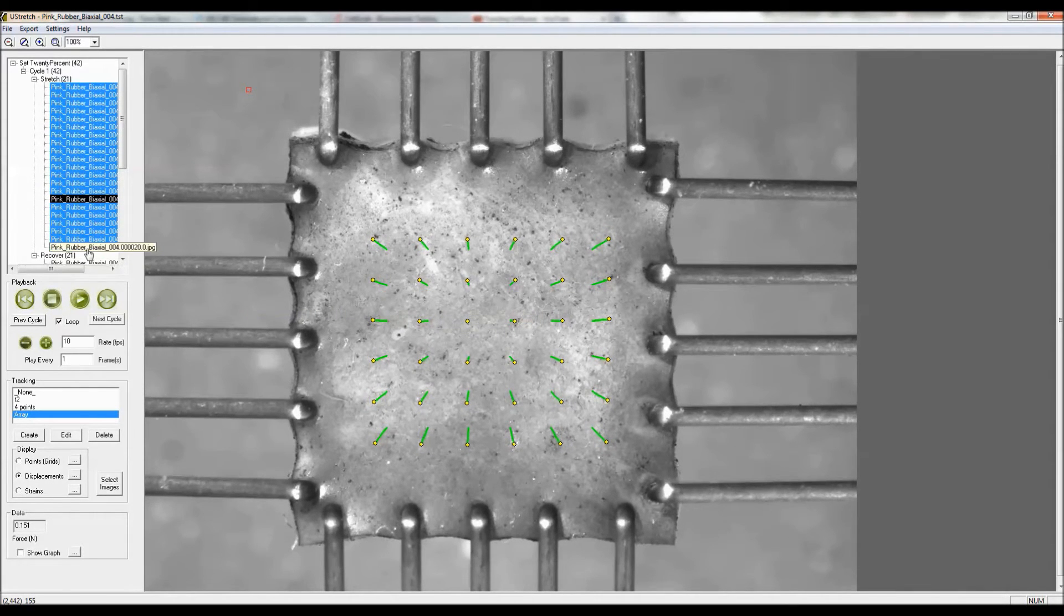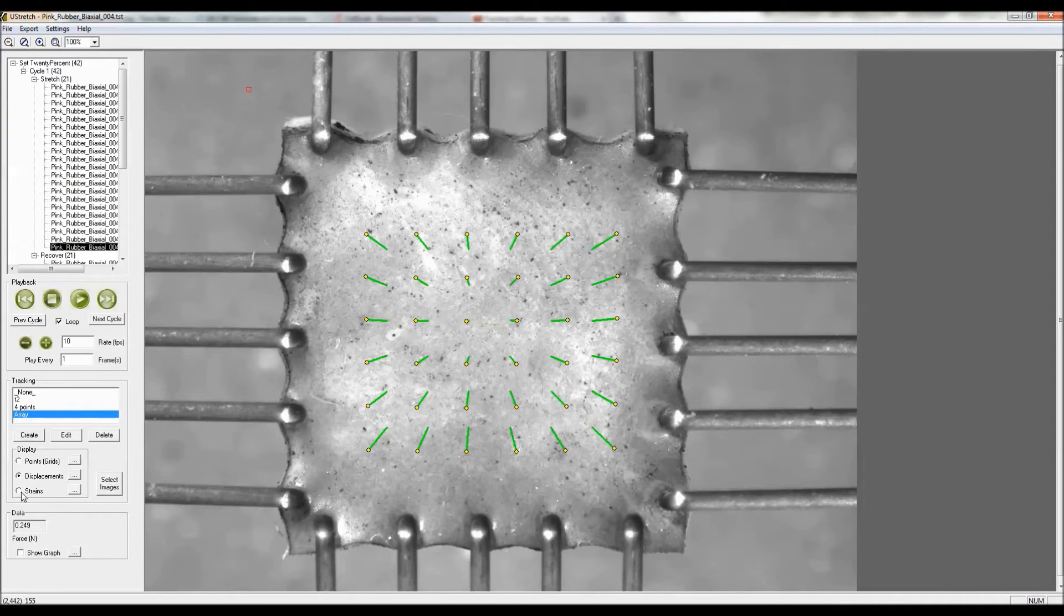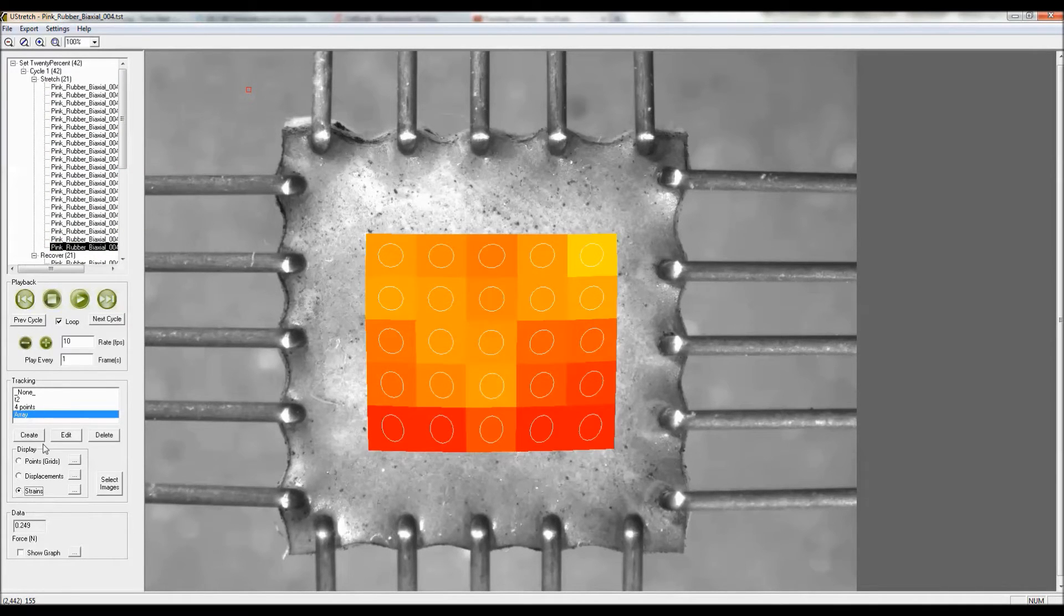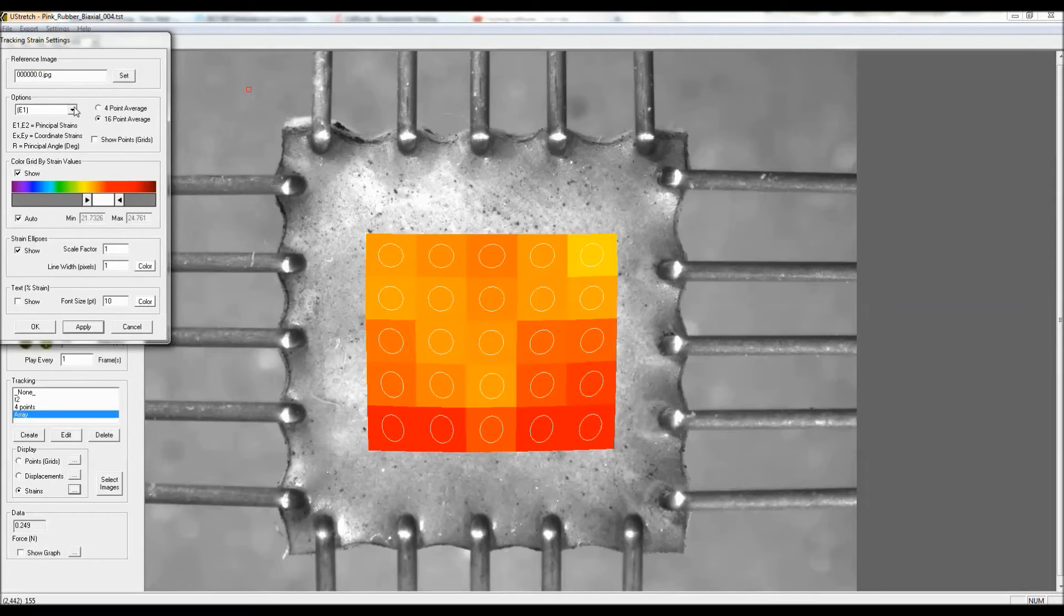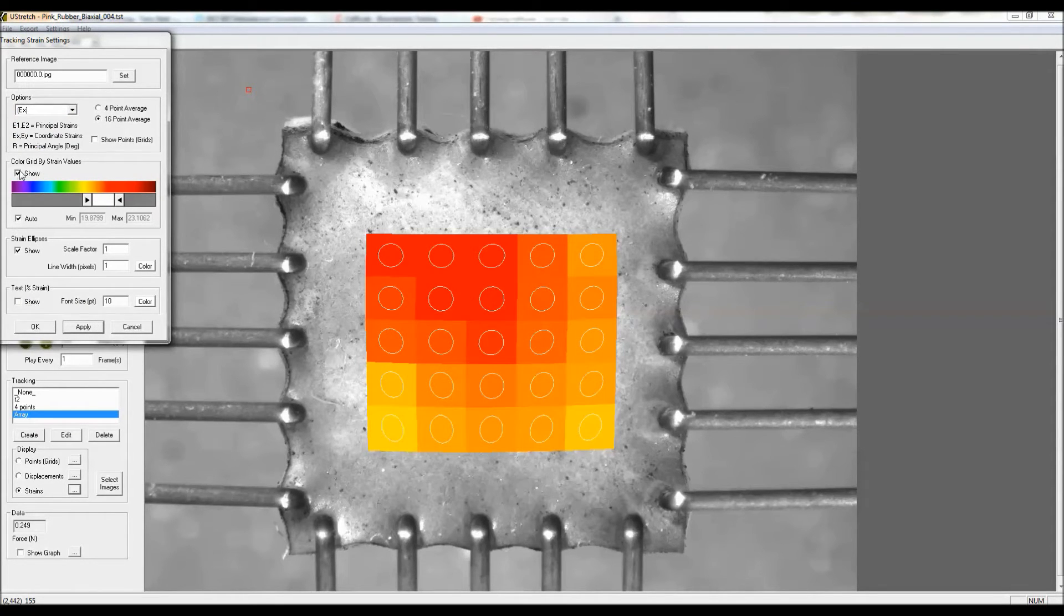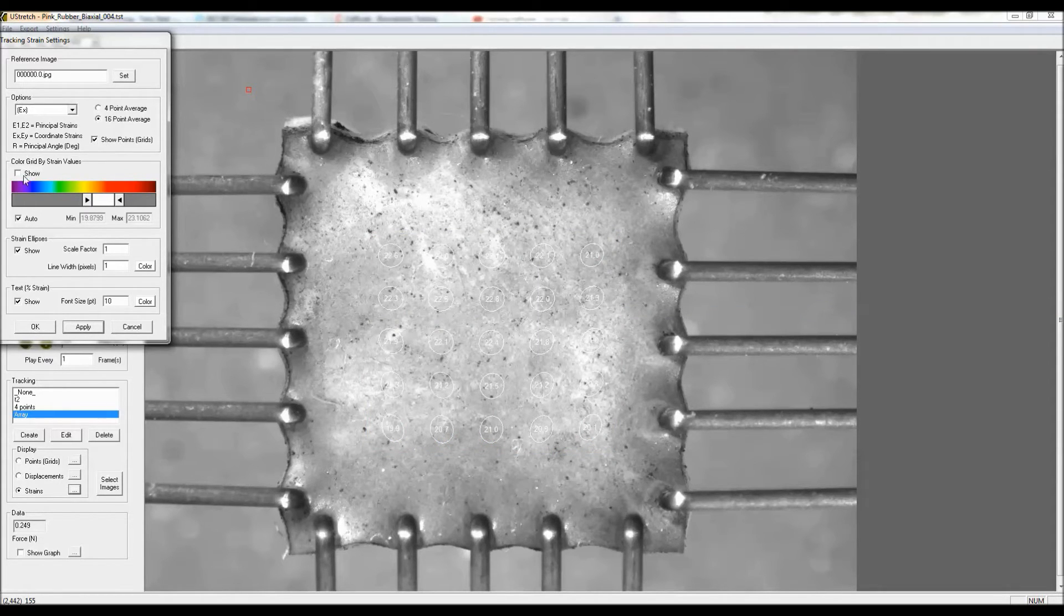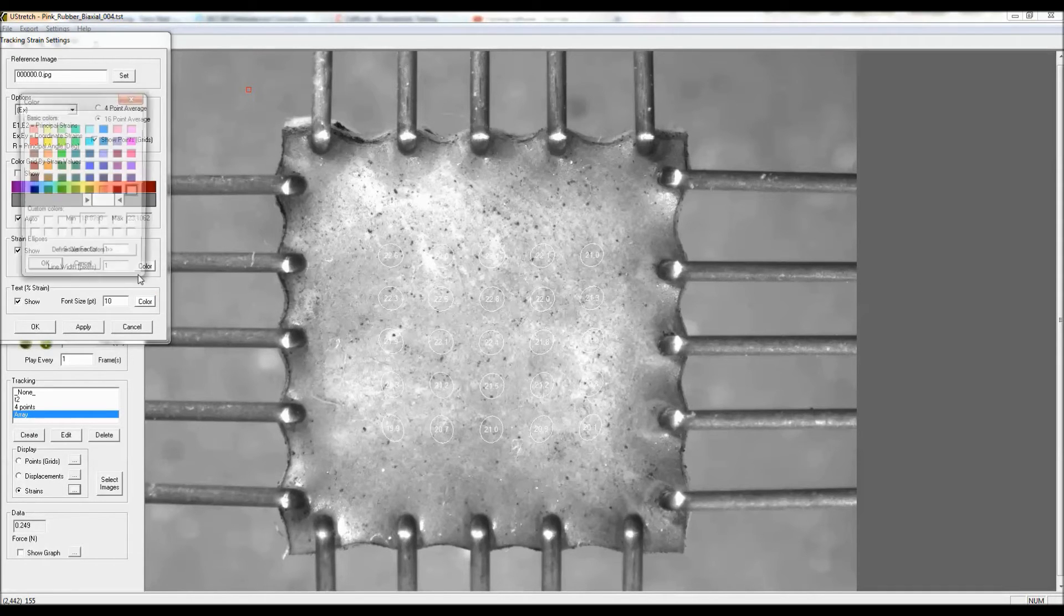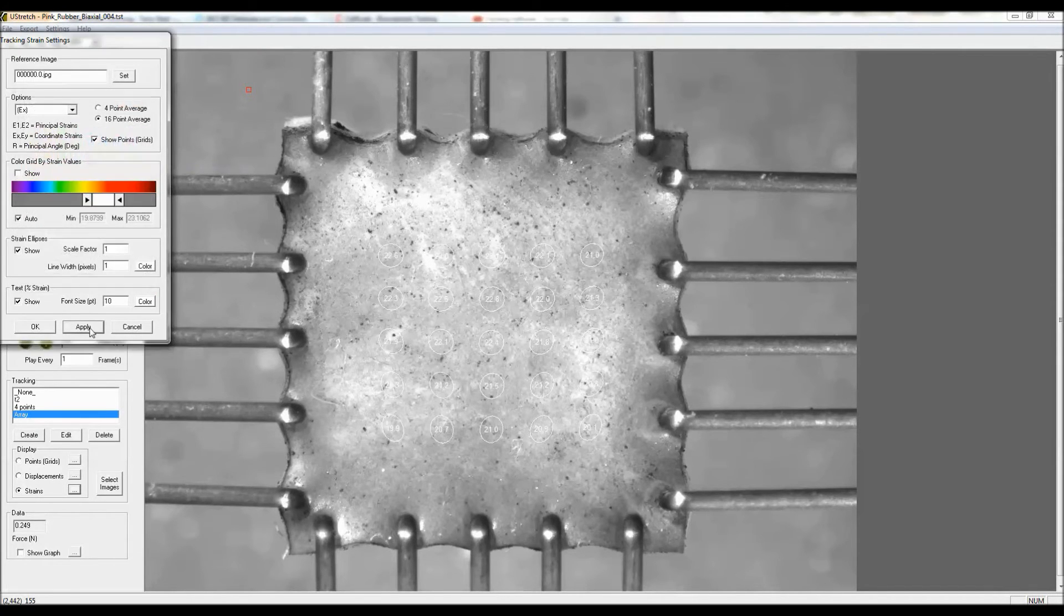The last thing I can do, I'll step to the last frame, is also show the strains because I've tracked an array. And here we can show for example the X strains, and I'll show the text for those X strains here. Let's make the strains in a red color so we can see them a bit more clearly.